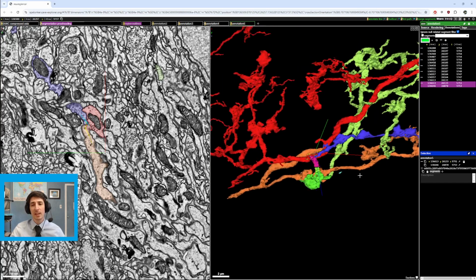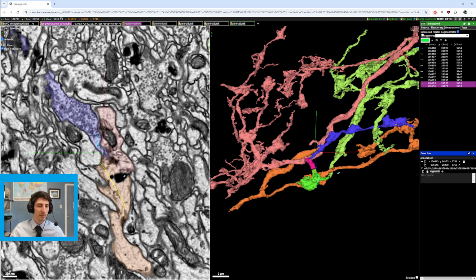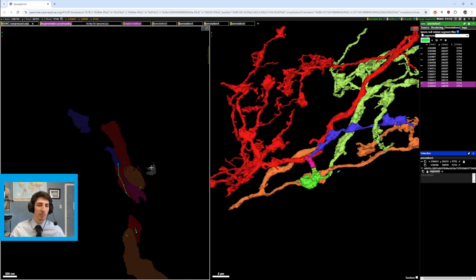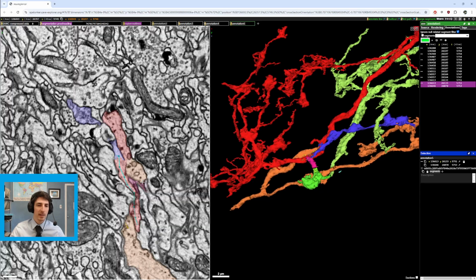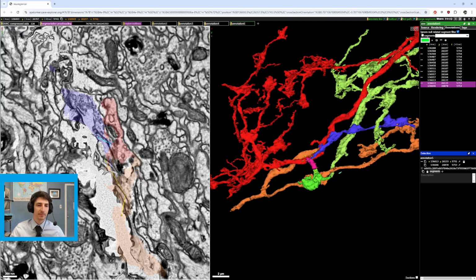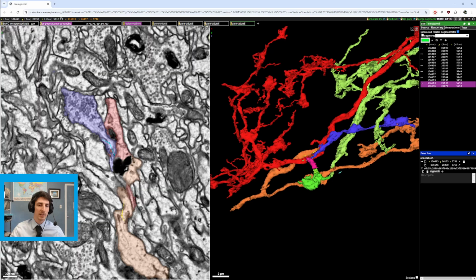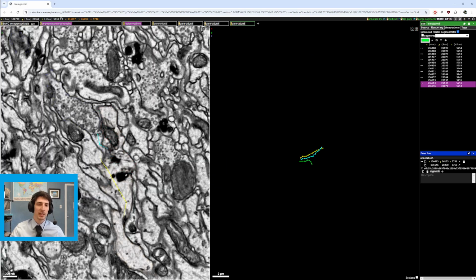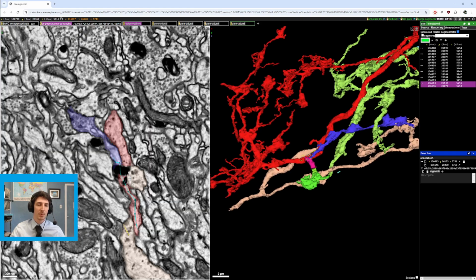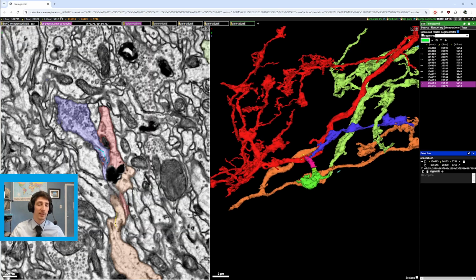So we have a pretty difficult area here. As you can see, this type of merger, we have a tear in the segments, we have a membrane swirl, we have missing slices, and we have some biological merger type things going on as well, which is a merger where the natural membrane is almost invisible, which can be tricky for the AI to pick up, and it's more of a human-oriented task to be able to recognize those, at least for now.